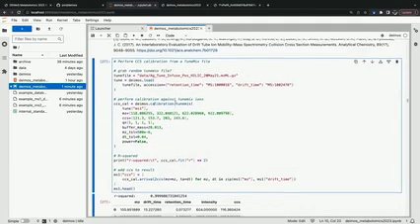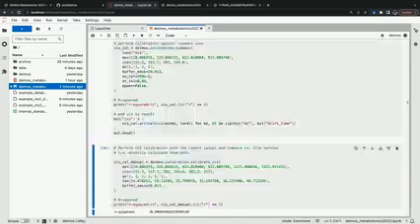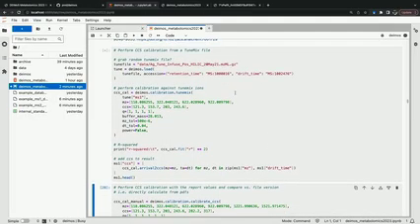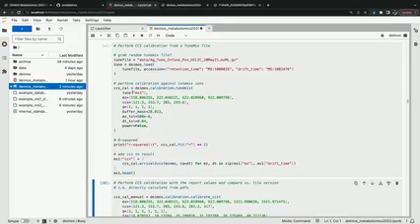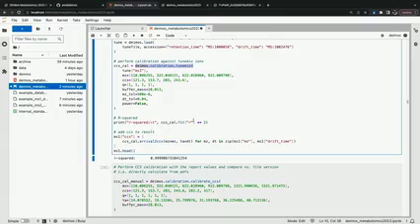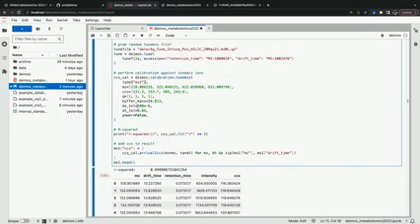Here we've included, as part of our example data, an actual tune file from the same day. This might take a while because we're loading the data as we did previously from mzML. We use this deimos.calibration.tunemix function and load in that tune file data, and we're looking specifically for certain tune mix ions.